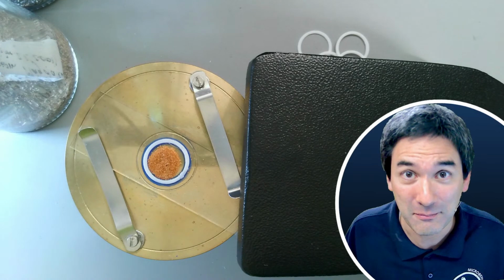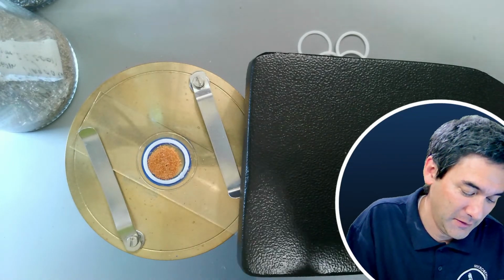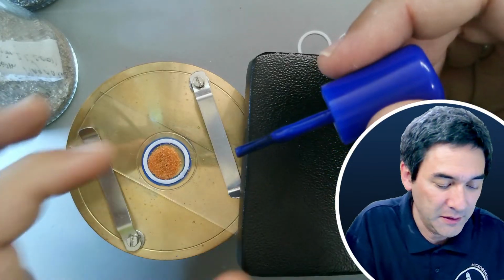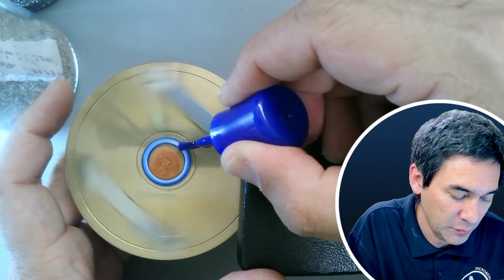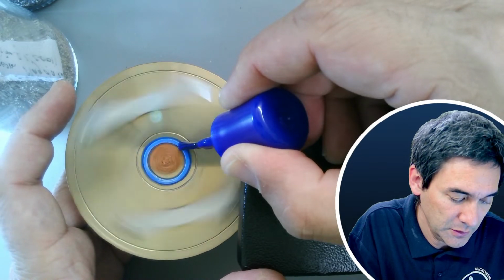I'm a teacher myself. So let's have a little look if this actually works out. I hope that the nail polish has dried sufficiently well so that the ring is not moving. So let's apply a little bit here. It seems to be fine. You know what?